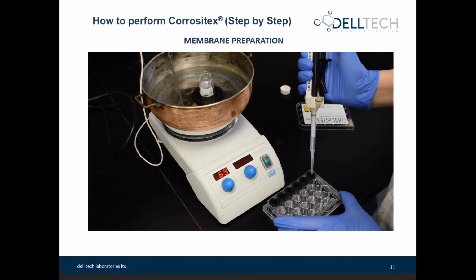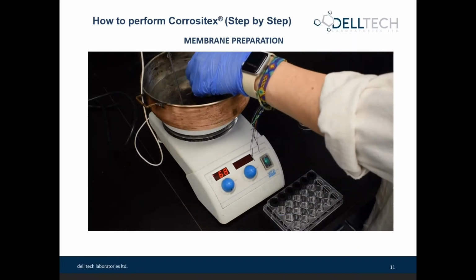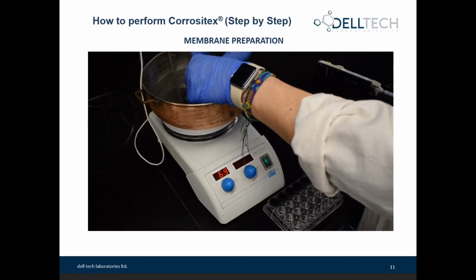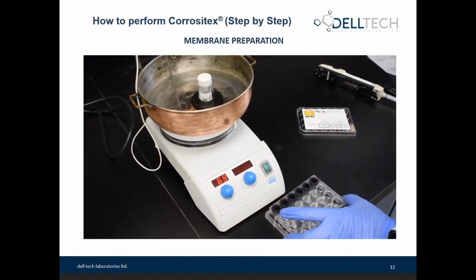Be sure to cover the entire membrane and that you have no air bubbles formed. Any air bubbles in the gel will alter the outcome of your test. If that does occur, you should discard that and replace it with a spare membrane. Any of the unused BioBarrier can be stored in an airtight wrap at 2 to 8 degrees Celsius and kept for 7 more days.